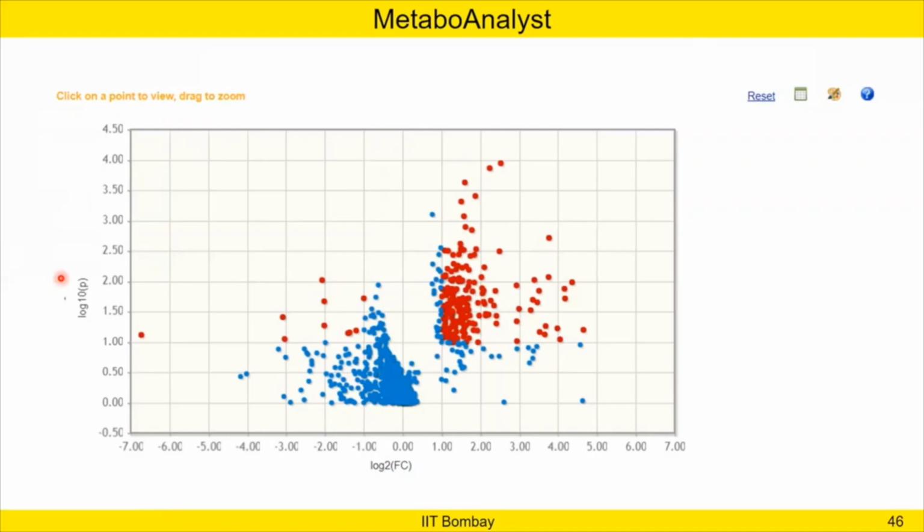But please make sure that over here, even if you are doing any statistical test, you should be very clear about which statistical test you should use. When you are normalizing your data and your distribution curve is showing normally distributed, go for statistical tests which are parametric, for example, student t test, right? But when your data is not normalized, or you haven't done the normalization of the data, in many proteomic analyses we don't prefer to do normalization. We want to keep whatever data we are getting. And in those kinds of cases, please choose a non-parametric test. That means the Mann-Whitney test, Wilcoxon's rank test, this kind of test you choose, right?